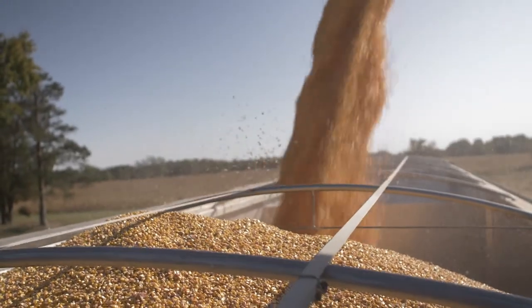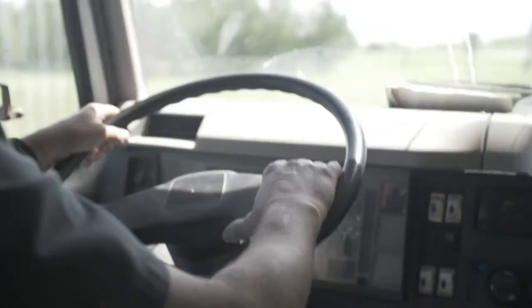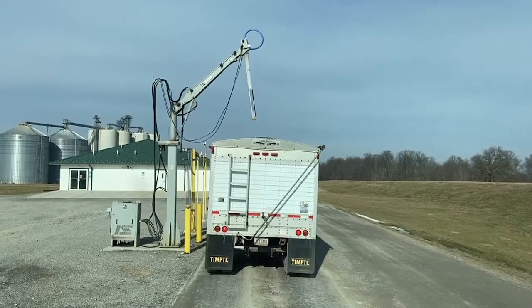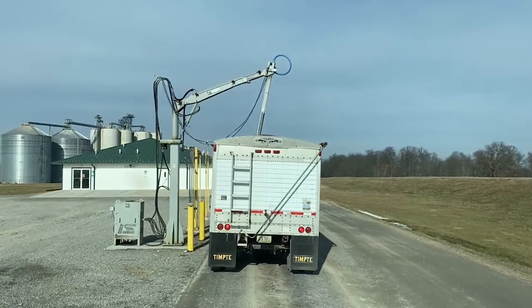This year has certainly been different. We're hauling grain this year and you pull in there — a little bit the same — but then they pull you off to the side to run the vom test. What goes into testing corn for vomitoxin? Here's a little bit of what it takes.